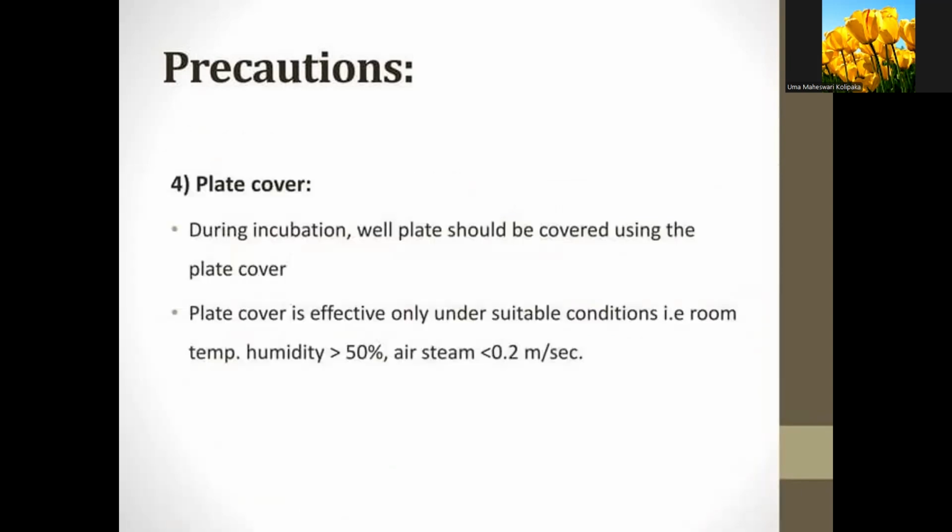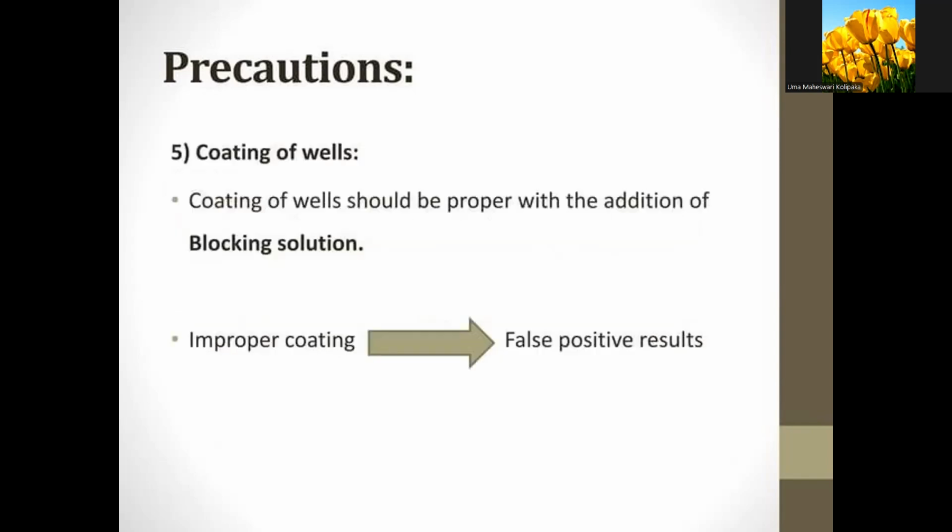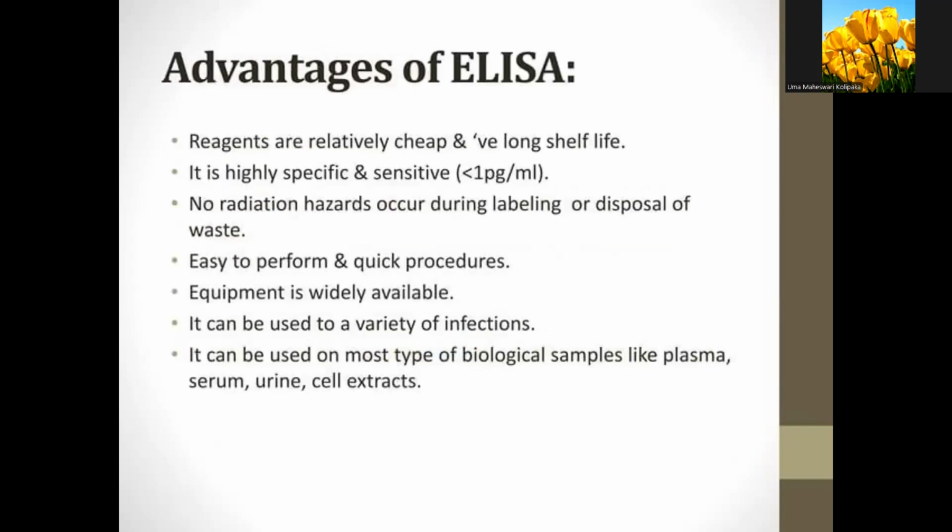Plate cover: during the incubation, well plates should be covered using the plate cover. Plate cover is effective only under suitable conditions, that is room temperature, humidity more than 50%, and air stream less than 0.2 meters per second. Precautions: coating of wells should be proper with the addition of blocking solution. Improper coating gives us false results.